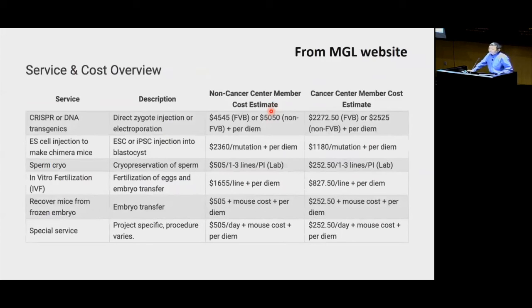I think for many flox alleles someone might want to make, the distance between the two LoxP sites could easily be less than a kb, and you could make a decent floxed allele by flanking one or two critical exons. Under a situation like that, if you're going to do it by CRISPR and injection into embryos, is that 2 guide RNAs and a single-stranded DNA template for homology-dependent repair, or what exact approach are you recommending?